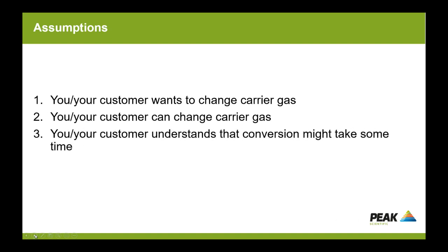It's also to understand that it may take some time to convert the methods. So if you are reliant on the GC in your laboratory and can't afford any downtime, it may not be the right decision for you to make. So certainly this is a consideration that needs to be kept in mind. Normally, conversion can be done fairly straightforwardly, but it's important just to understand that there are some potential changes to the method that may be required that can be a little more time consuming. And this is particularly the case with GCMS more than GCFID and other non-MS detectors.